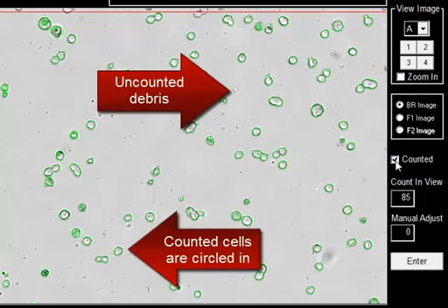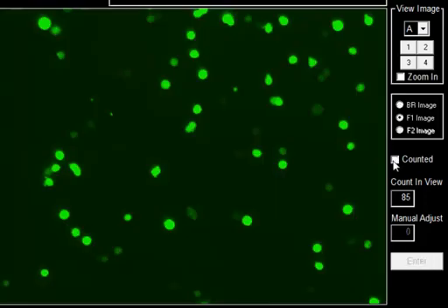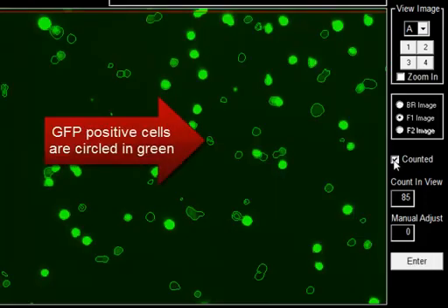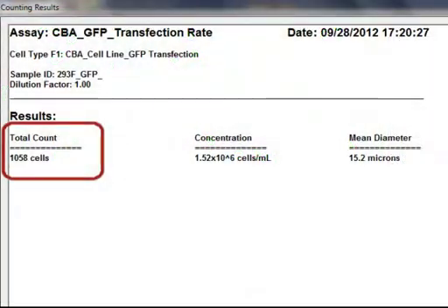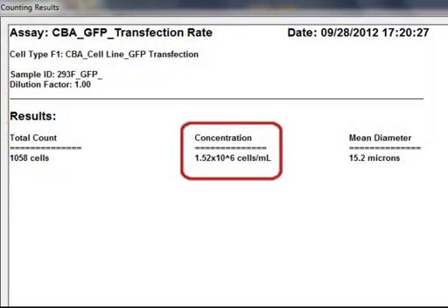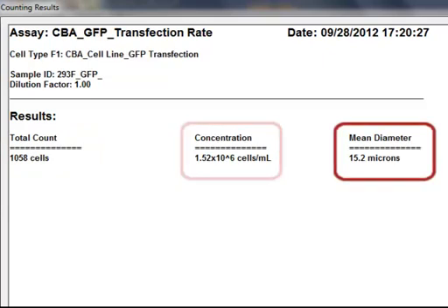GFP positive cells are counted in the fluorescent images. The cellometer results table displays total cell count, cell concentration, and mean cell diameter.